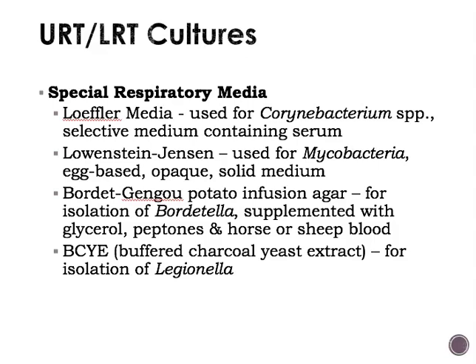Loeffler media is used for recovery of Corynebacterium species. It's a selective medium containing serum. Lowenstein-Jensen is used for mycobacteria. It's an egg-based agar. It's opaque. It's a solid medium. Bordet-Gengou potato infusion agar is for isolation of Bordetella. It's supplemented with glycerol, peptones, and horse or sheep's blood.